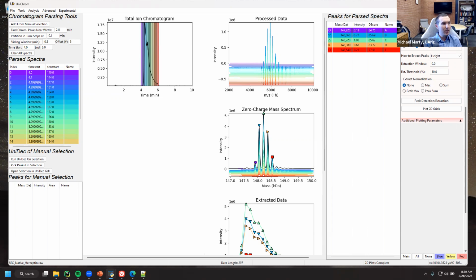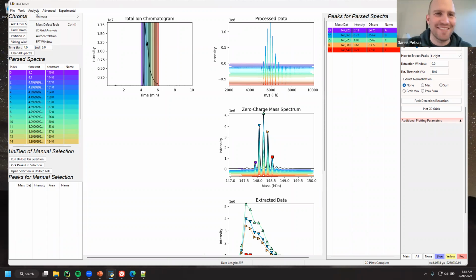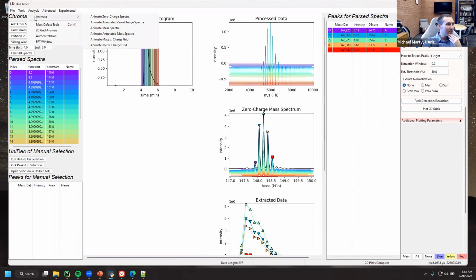Cool. What else would people like to see? It can also be very basic. I kind of nerded out a little bit as well, so if you have very basic questions, feel free. If there's anything interesting you want to see, there is this tool here you can use.